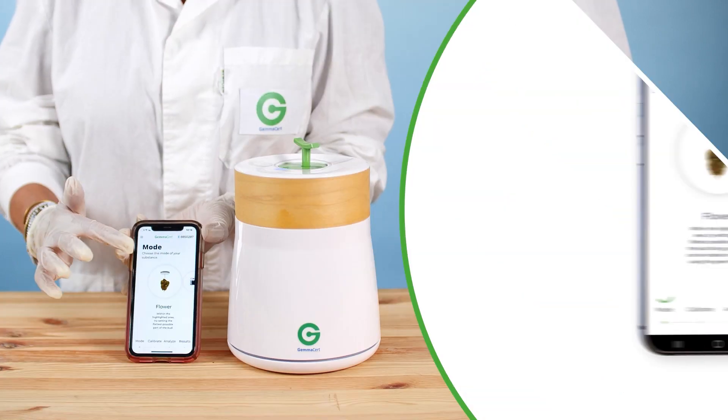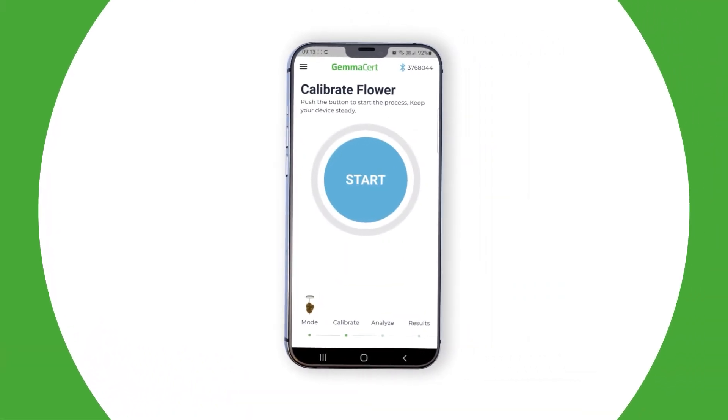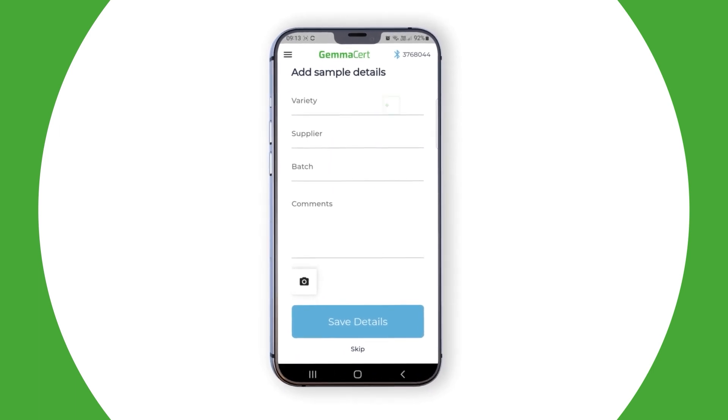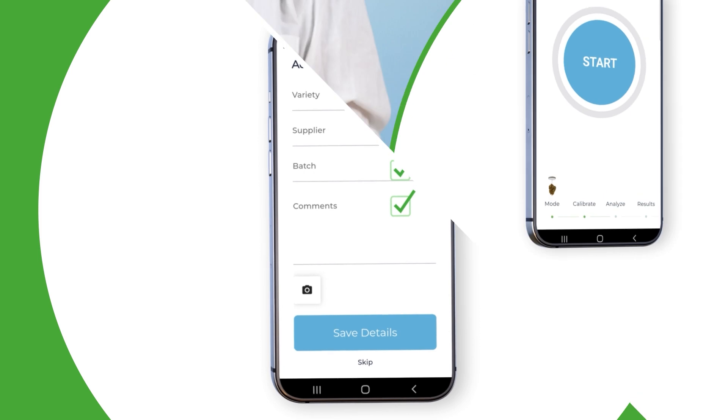Drive the drawer down. Select Mode, followed by Flower, and then choose Calibrate. Now you may enter optional information about the sample: variety, supplier, batch ID, and comments. Press Calibrate.